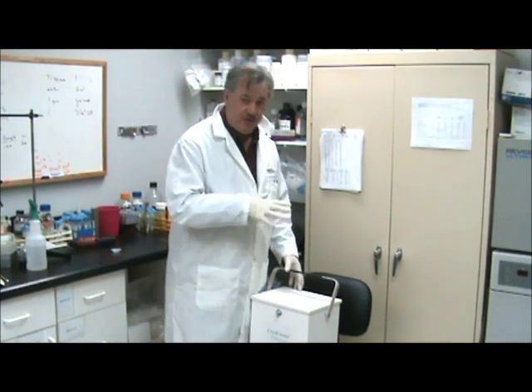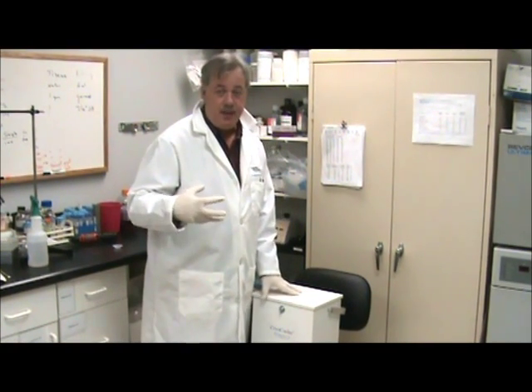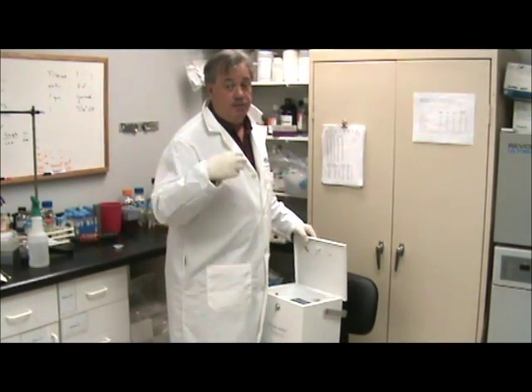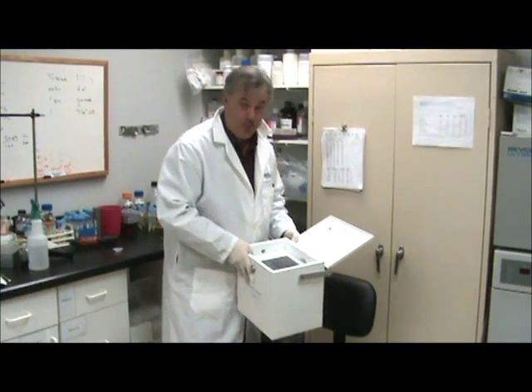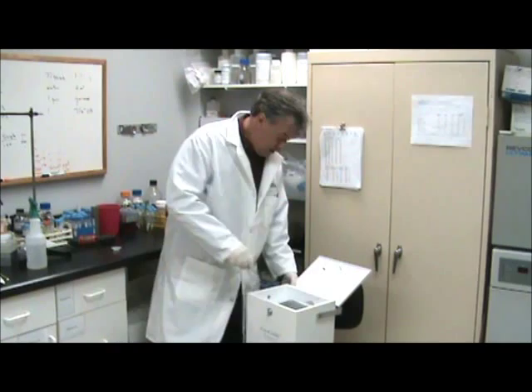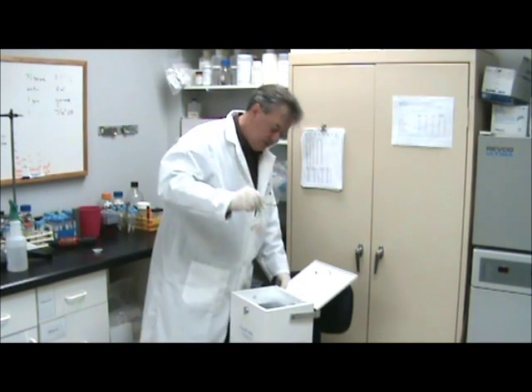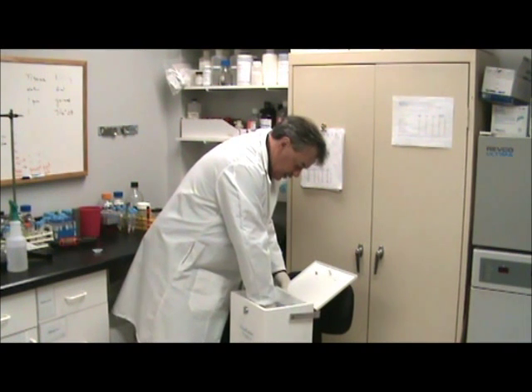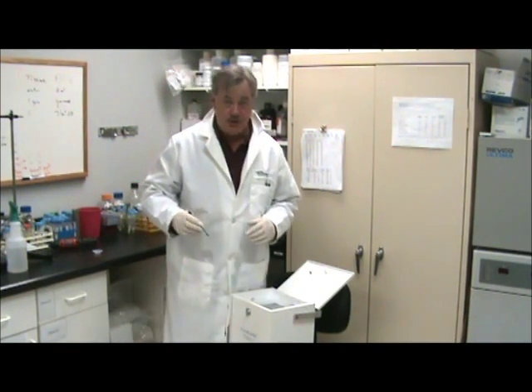We're going to be using the Cryo Grinder. This is an older version so yours might not look exactly like this. I was concerned about how cold the sample was, so I actually went to the far extreme — I removed the tray, removed the pillow. What I have now, which you probably won't be able to see, is a pool of liquid nitrogen down in the bottom. I'm using a small pestle and a mortar; these things are highly chilled and I actually have pooled liquid nitrogen in the well.